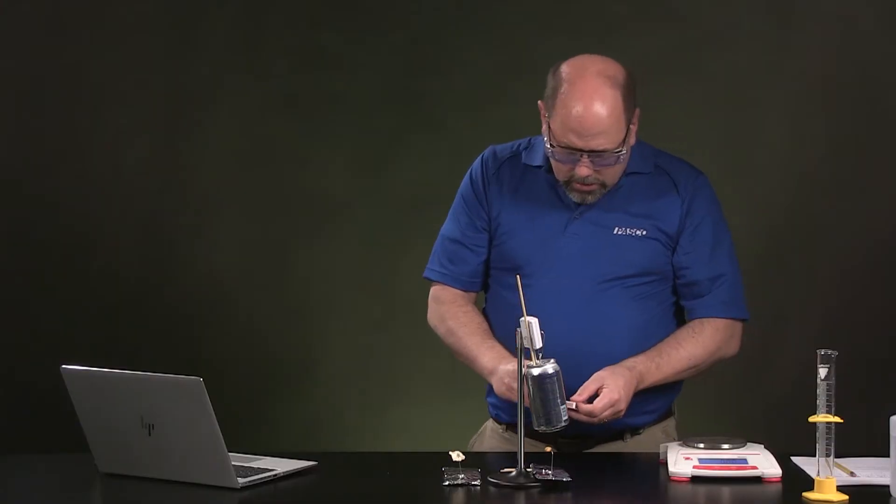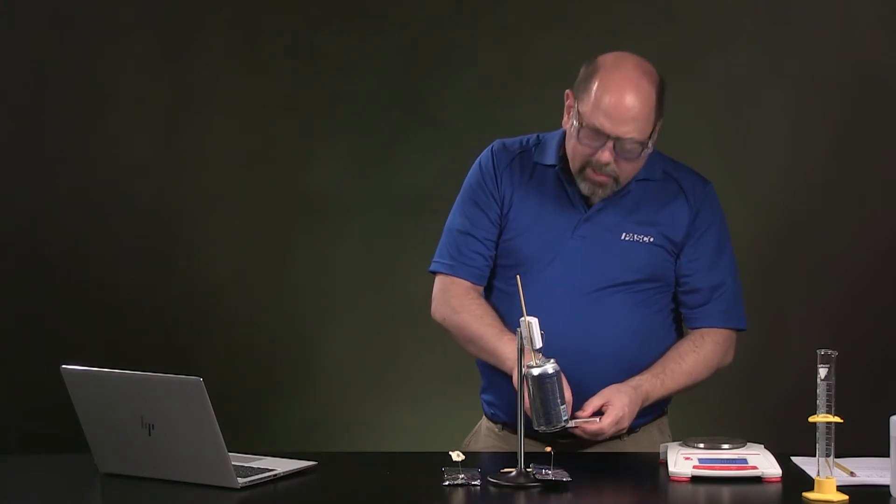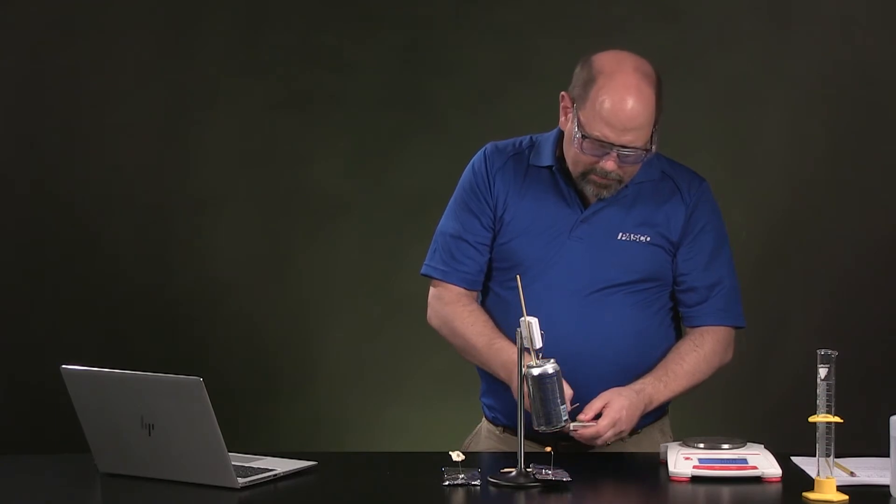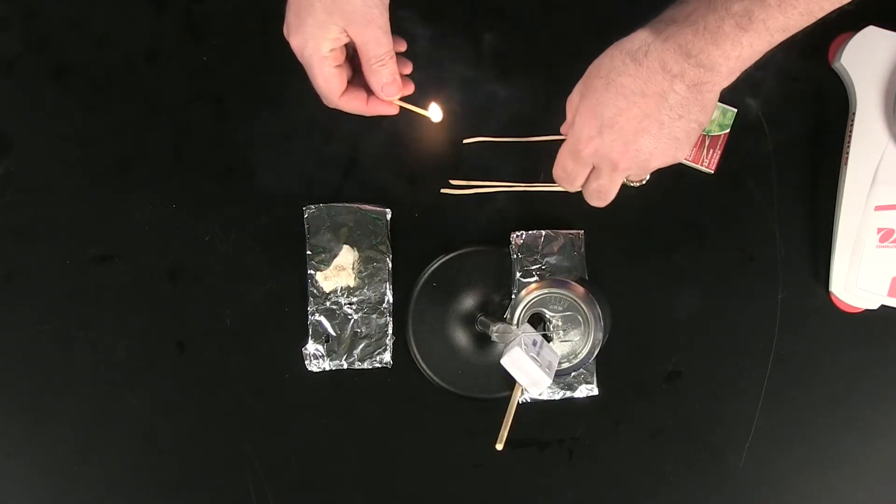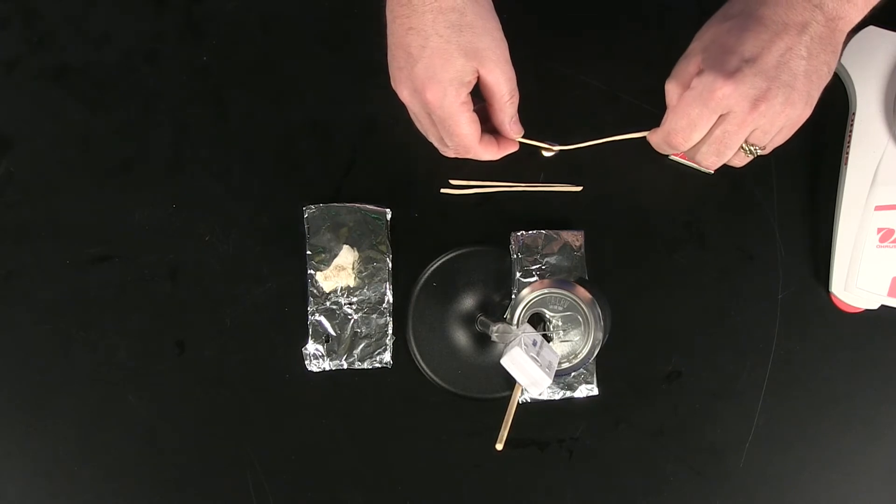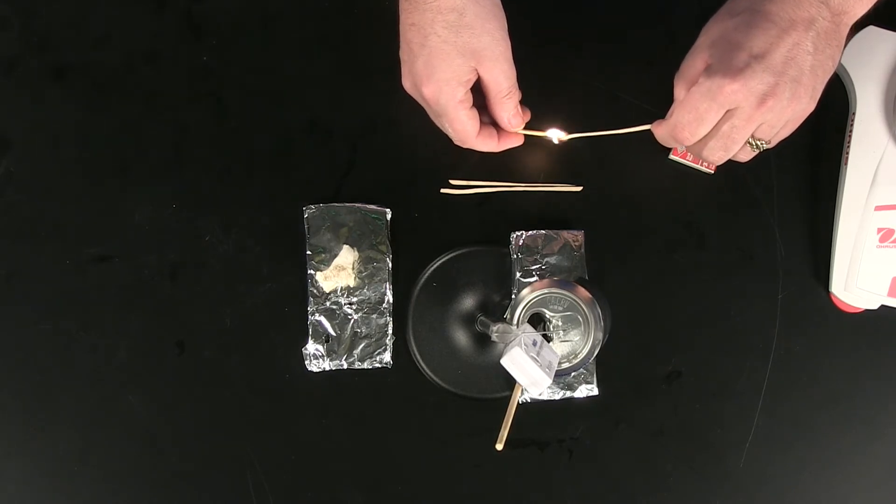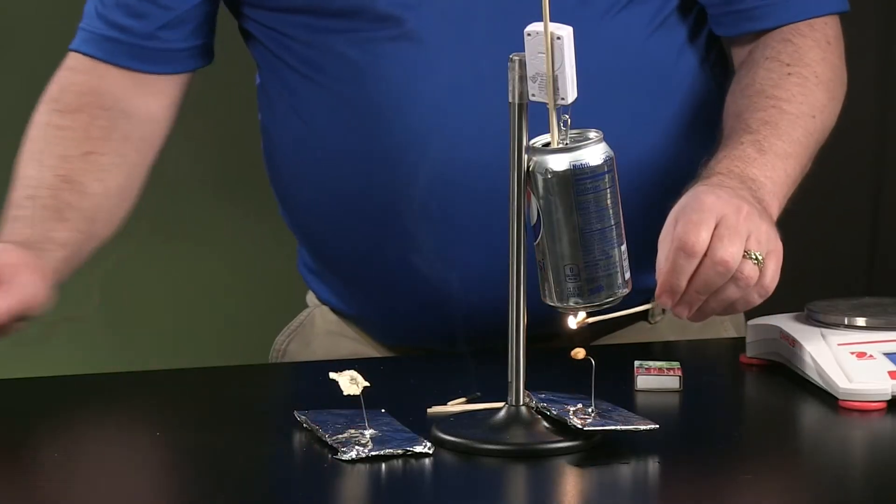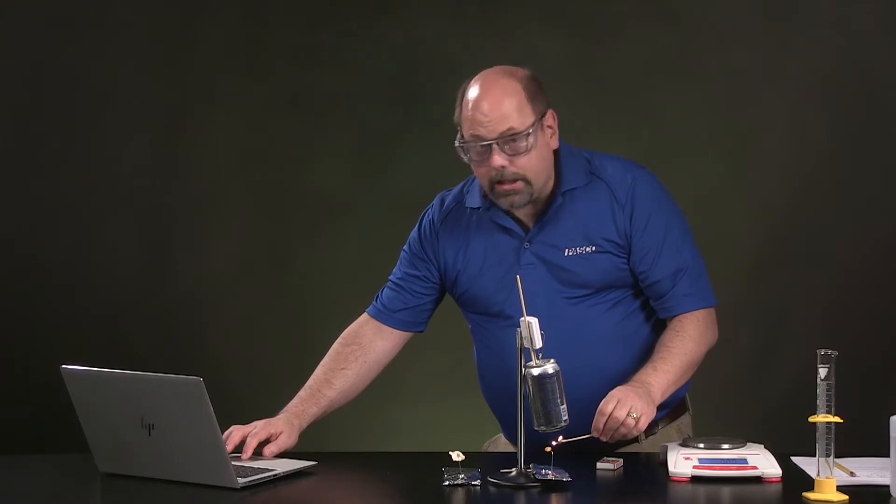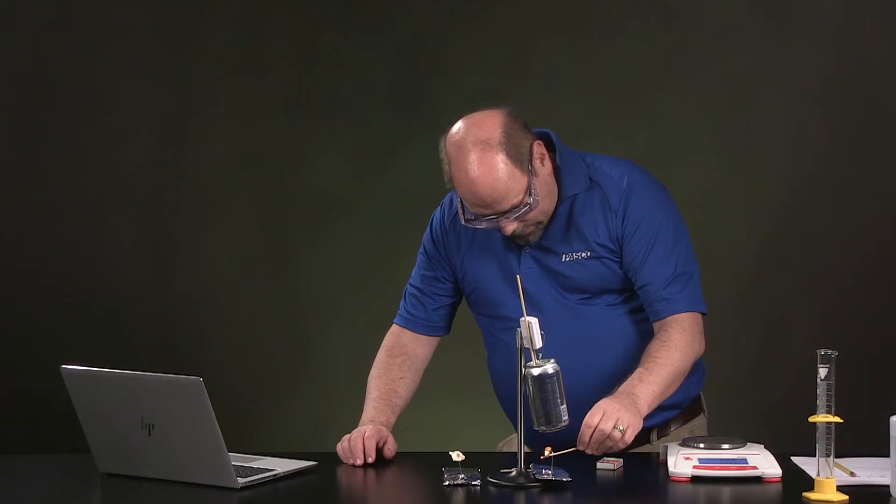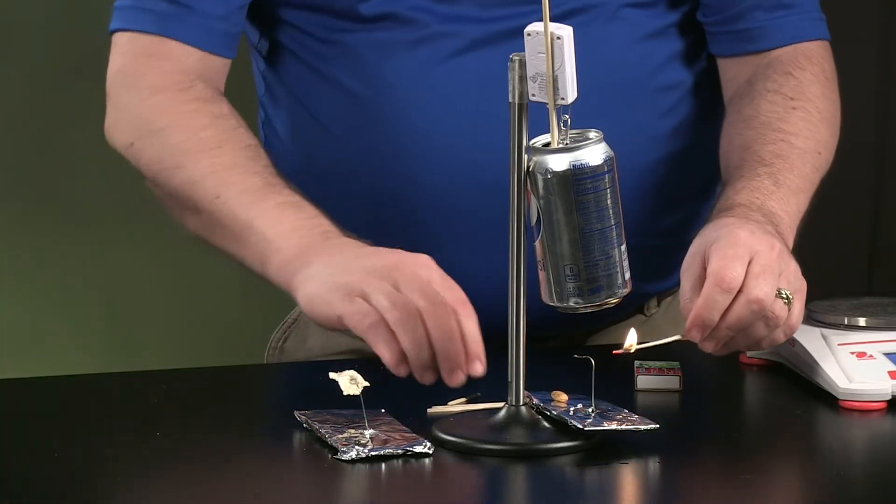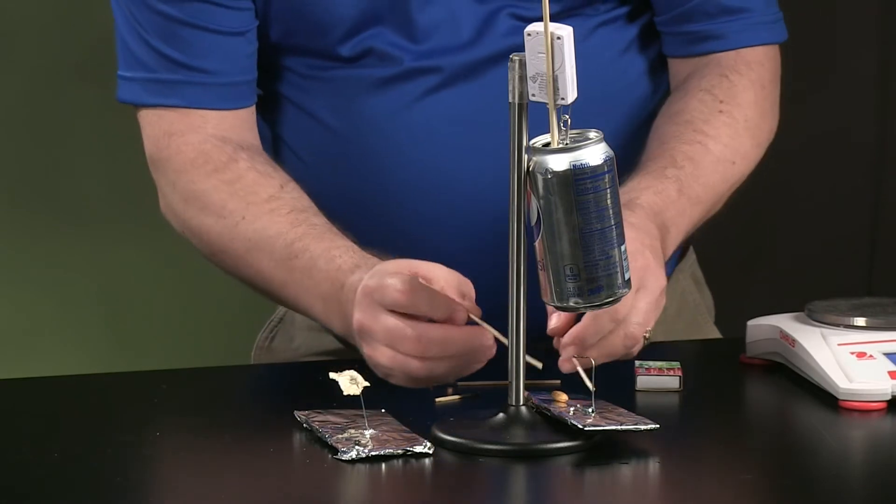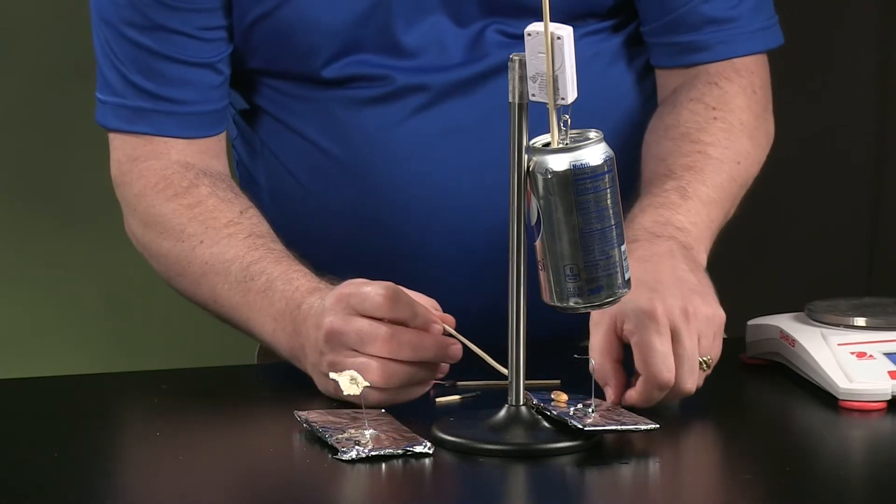Get that nicely positioned underneath. I'm going to light this stick because it takes a little bit to light the peanut, to get the peanut started. If it takes you a couple of matches, don't feel bad about that. Just keep using them. I'm going to use this longer stick though, so I can get that started. Before I start that, I'm going to make sure I start the data collection. Then we're going to start the peanut on fire here, except for when it falls. So, that's just going to take a second.